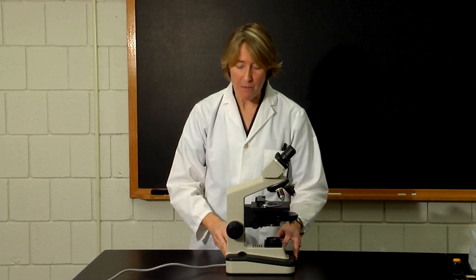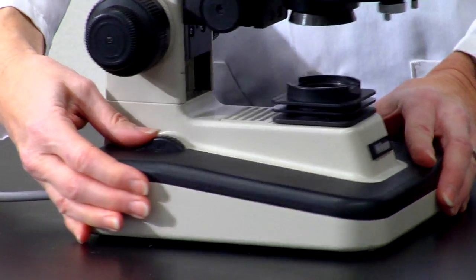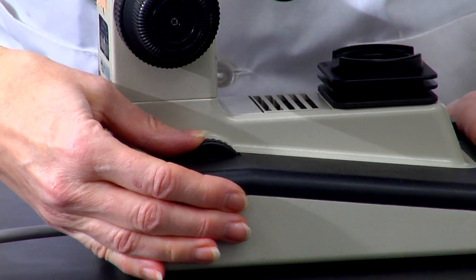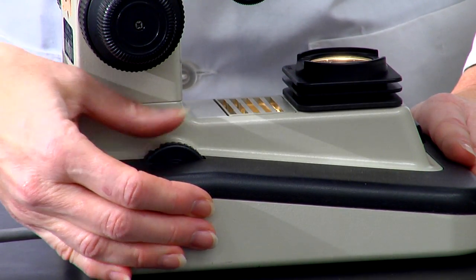The base of the microscope contains the light source, and there is a switch along the side which turns the light on, as well as adjusting the intensity of the light source.